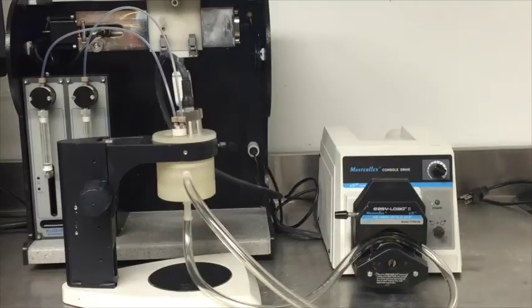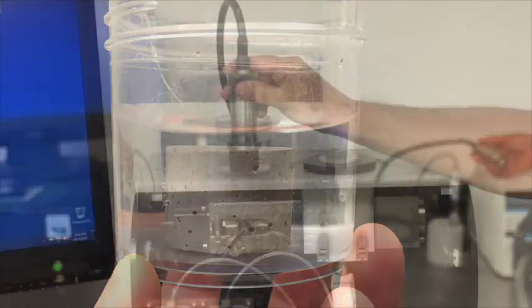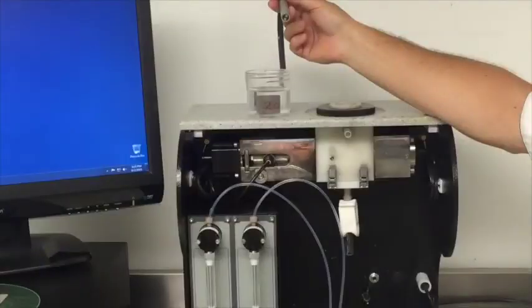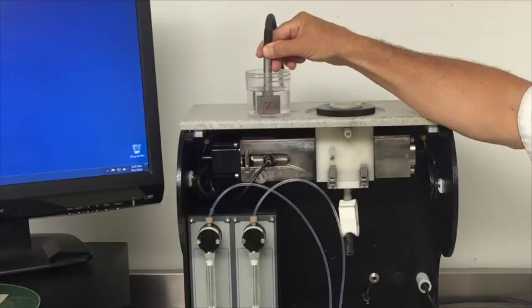When characterizing the zeta potential in porous materials, the probe can simply be placed in contact with a porous block, as we will demonstrate now. We also have a special setup for measuring the porosity of porous material with our aqueous conductivity probe, which functions at a high frequency of 3 MHz in order to eliminate electrode polarization.